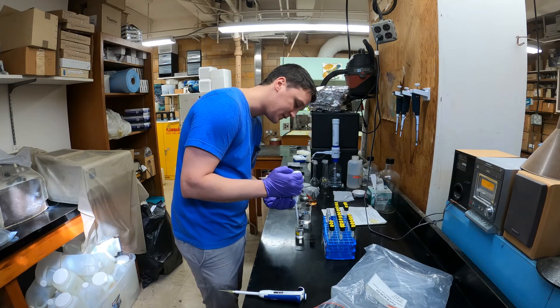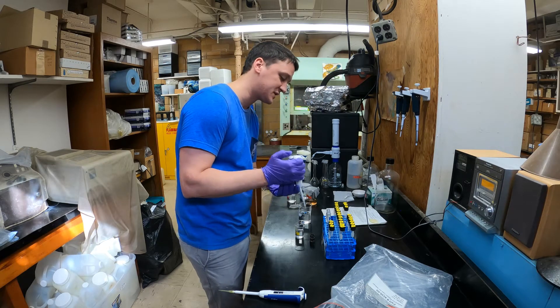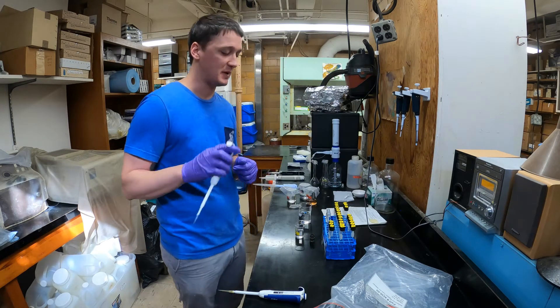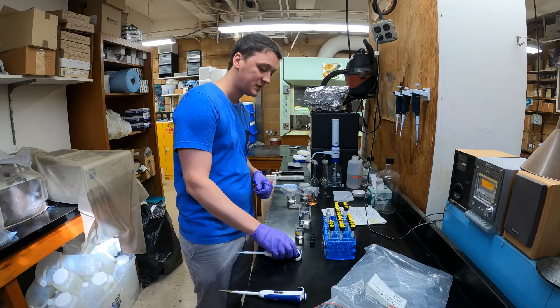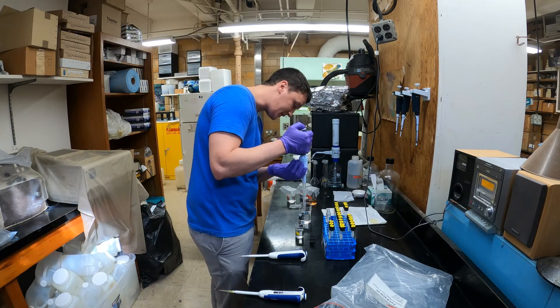I'm just trying to be really consistent with the pipette, because with this small volume — just two microliters — any little change in how you do the pipette can really change how much you're actually measuring out.